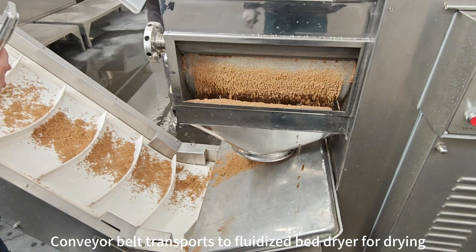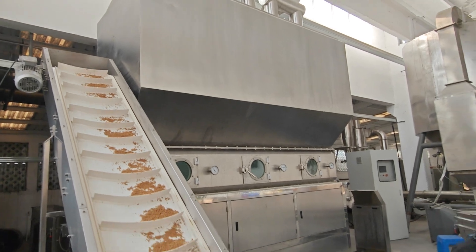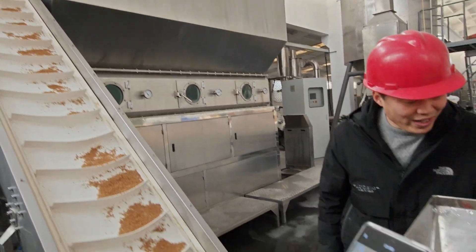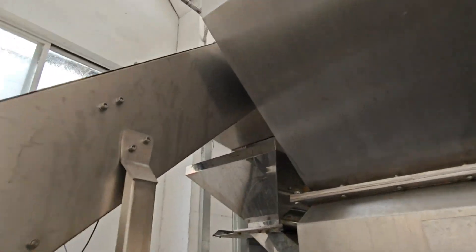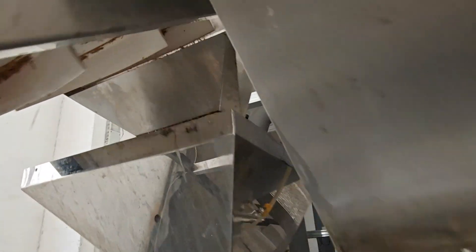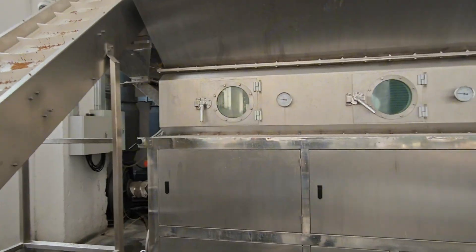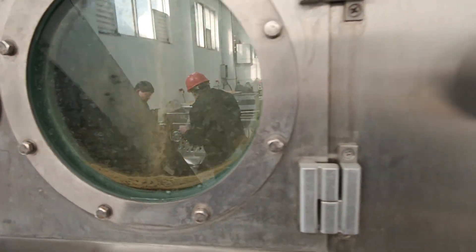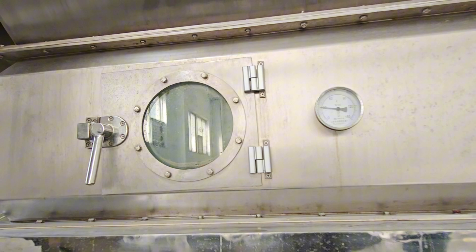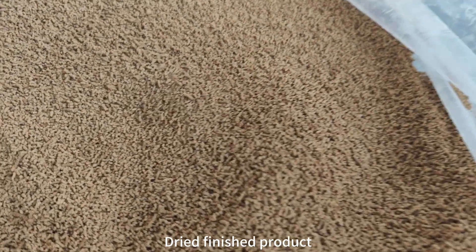The conveyor belt transports to the fluidized bed dryer. Dried finished product.